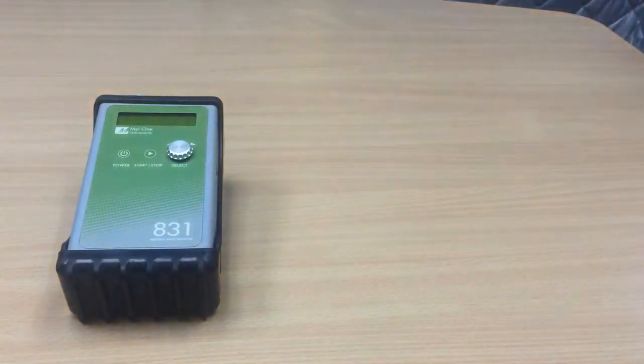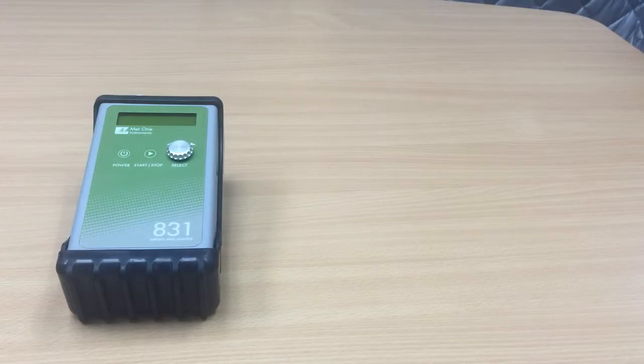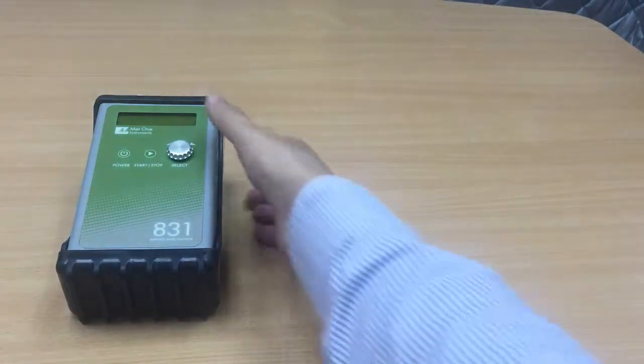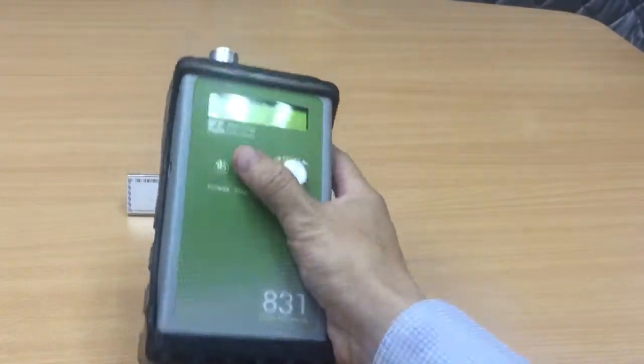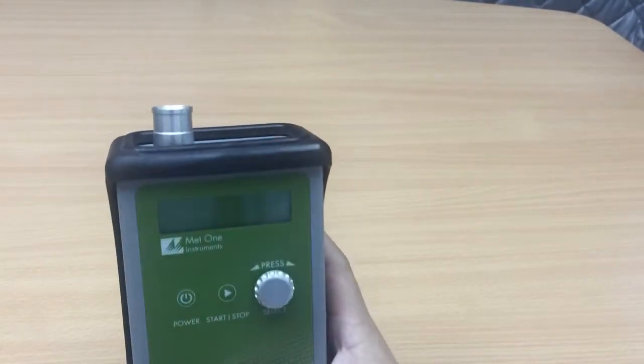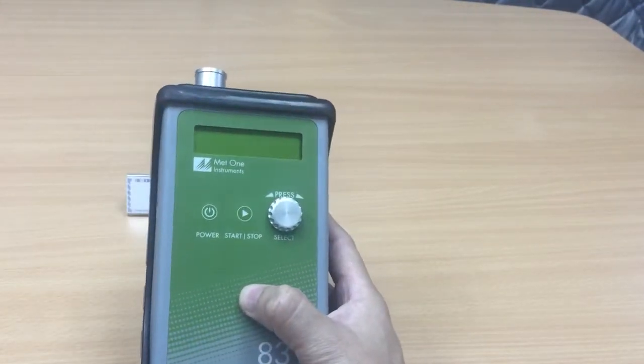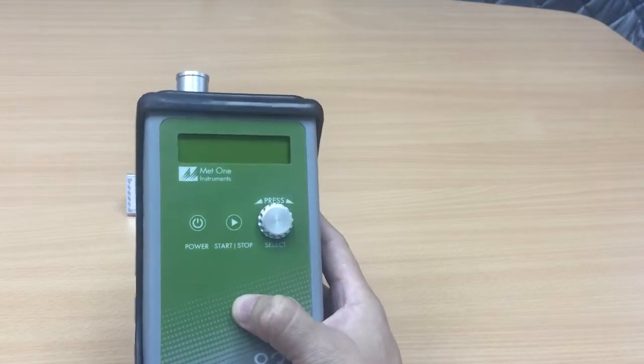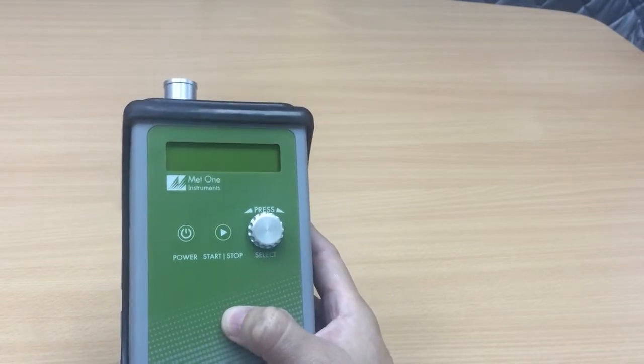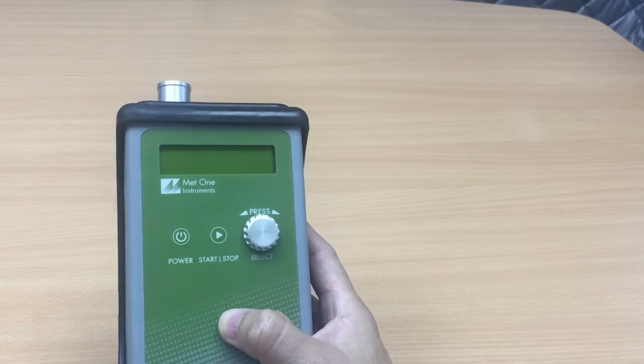Basically this Aeroset 831 is a small lightweight battery-operated handheld mass profiler. It counts and sizes particles in different size ranges and then uses a proprietary algorithm to convert the count data to mass measurements in micrograms per cubic meter.